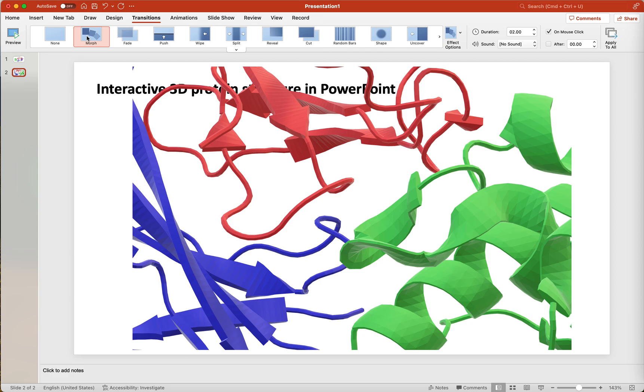I hope you find this tutorial useful to introduce your protein structure as a three-dimensional object in your next PowerPoint presentation. Thank you so much for watching.